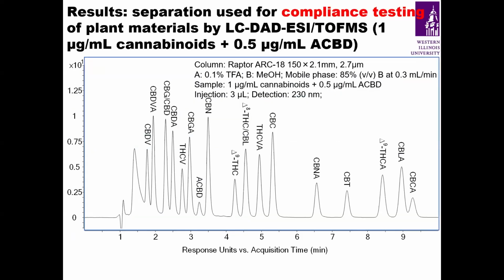Here are the results. So separation used for compliance testing of plant materials by LC-DAD ESI TOF-MS is demonstrated in this chromatogram.